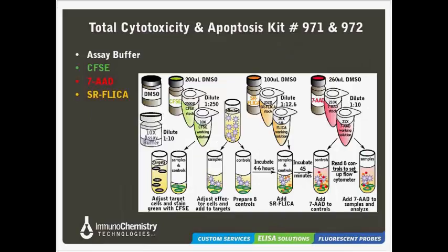To use ICT's total cytotoxicity and apoptosis kit, just as with the basic kit, you would first start by labeling the target cells green with CFSE.